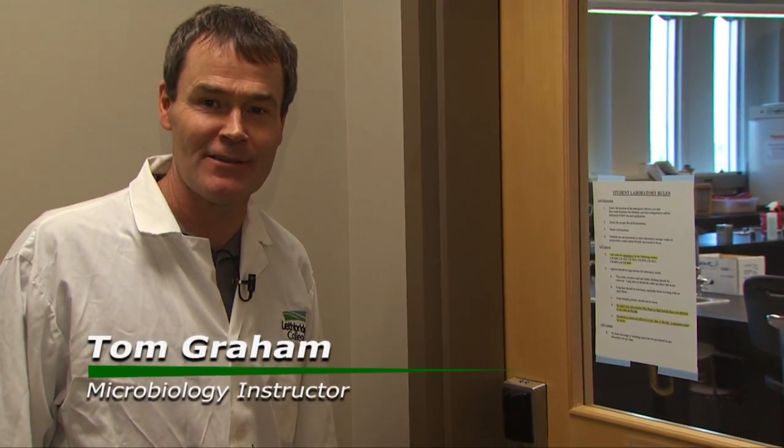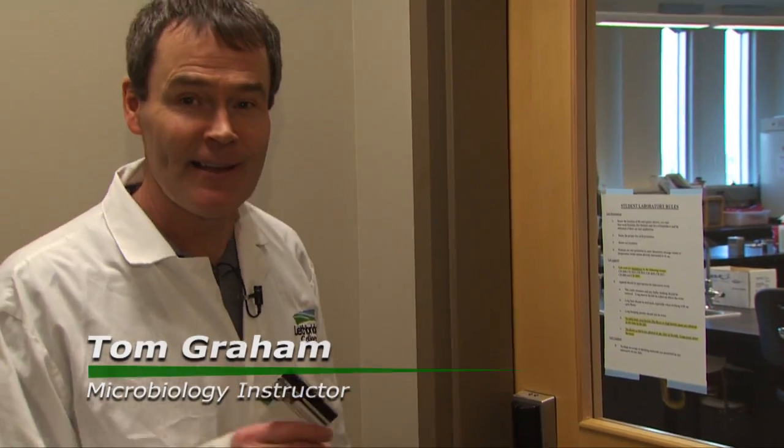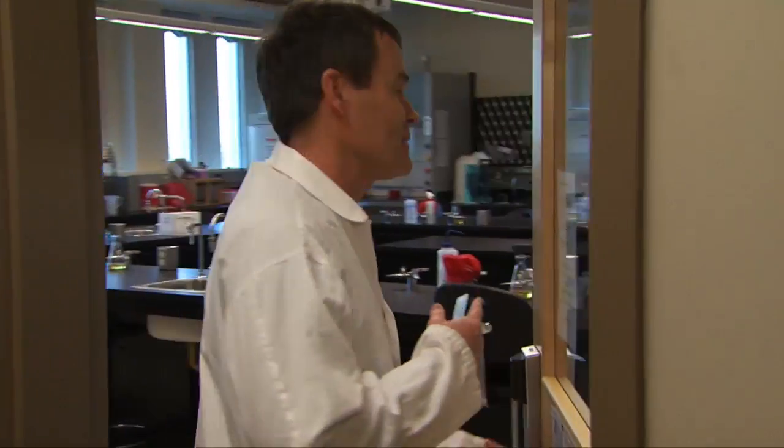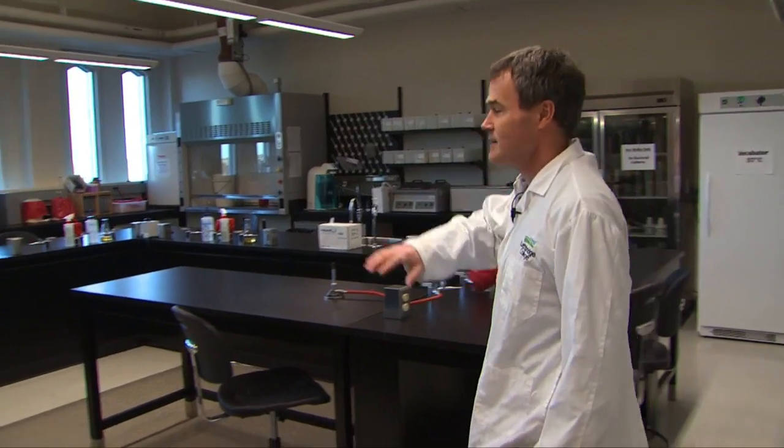Hello everyone. My name is Tom Graham. I'm the microbiology instructor for Bio 162 and I'll introduce you to my labs. This is CB4002 and this is a teaching microbiology lab. It's set up really nicely so we can have lots of time with the students and you get full-on time to talk to me and understand what you're doing.